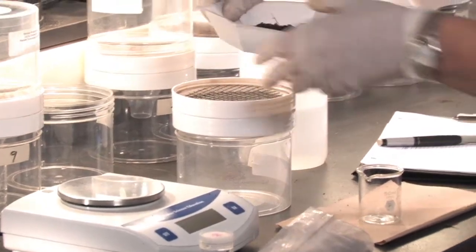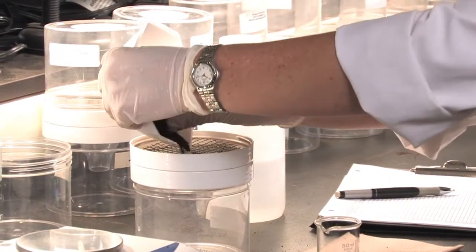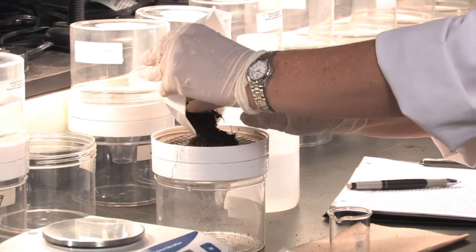We now take our soil and place it in the extractor.